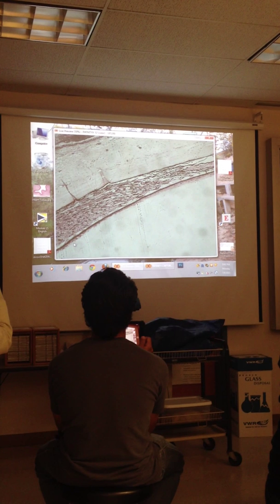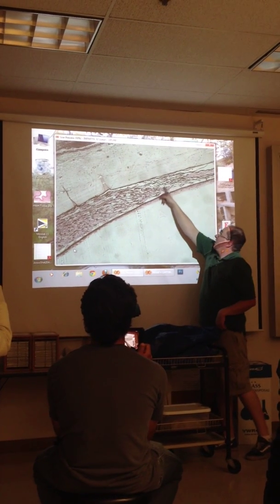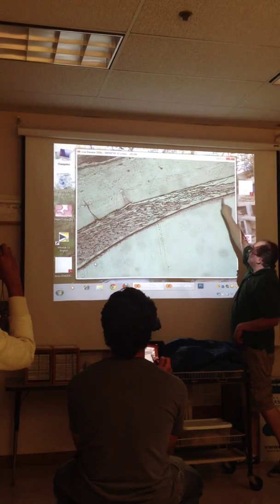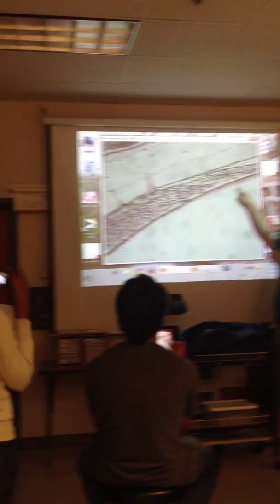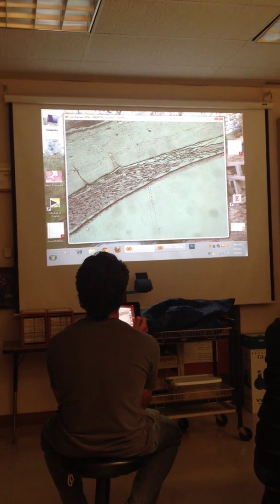So you're seeing all this sclera in line there with the choroid, the vascular layer, which you're seeing right through here, which should be the choroid, right? And you're starting to see nervous tissue show up there as well, and that's going to be the retina starting to show up. And you're going to see a really well-defined retina as we work our way back here.